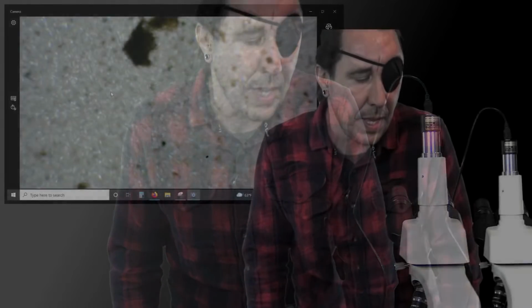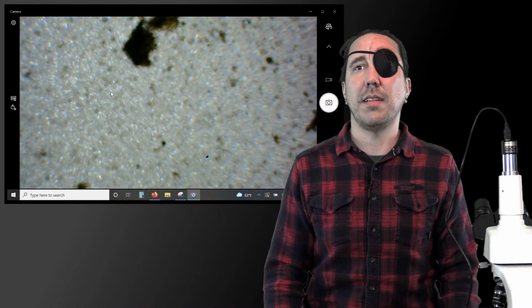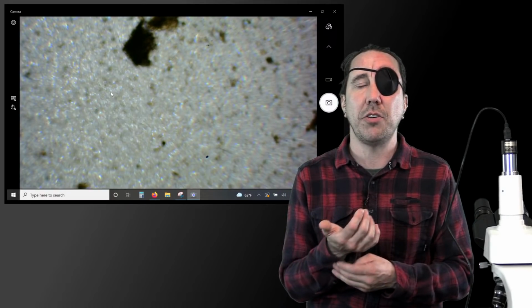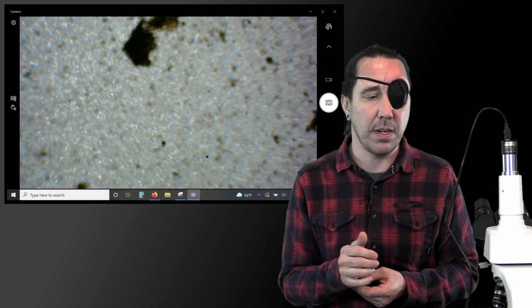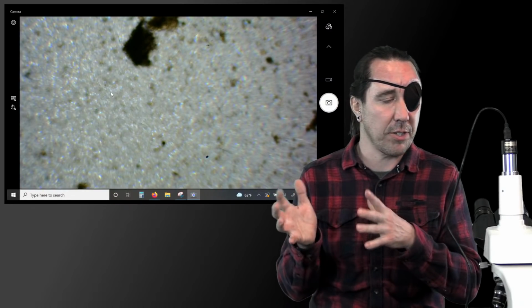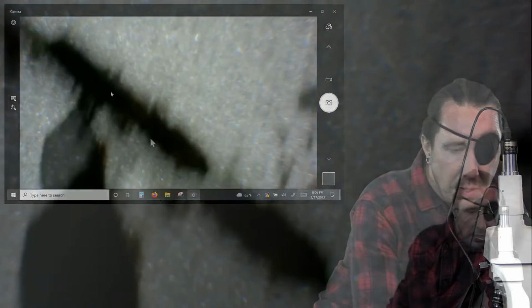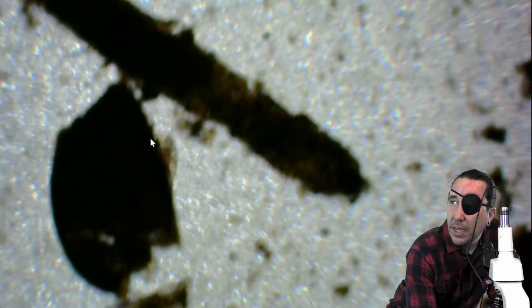But you'll get it to the point where you're sticking it underneath there. You may have to refocus or readjust your frame, but you want to get the head of the nematode into your frame so that you can closely view it and identify it by the mouth part. I just want to make sure and remember to tell you all that while I'm going through this sample. But we can start hunting for more stuff here now.